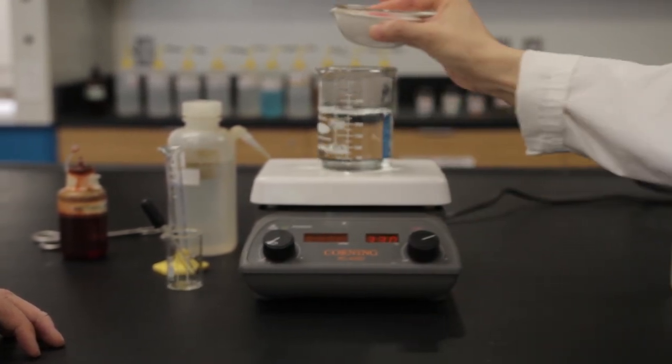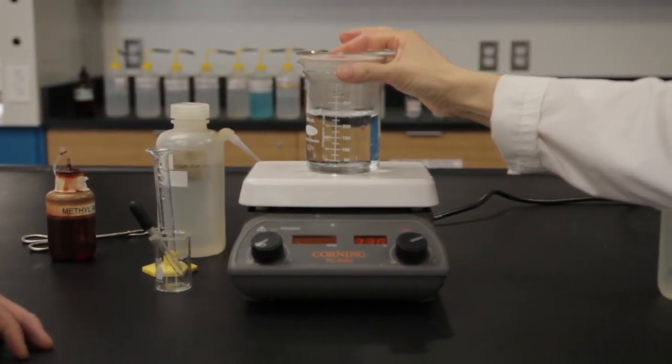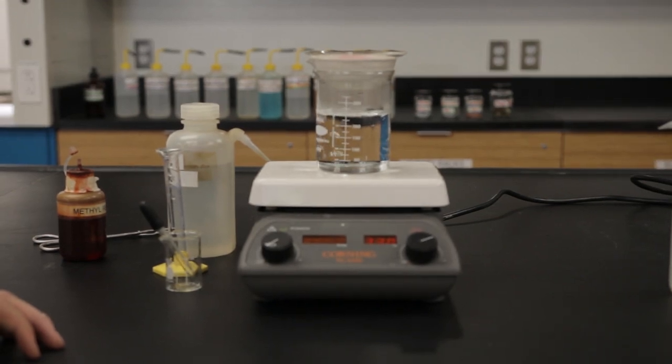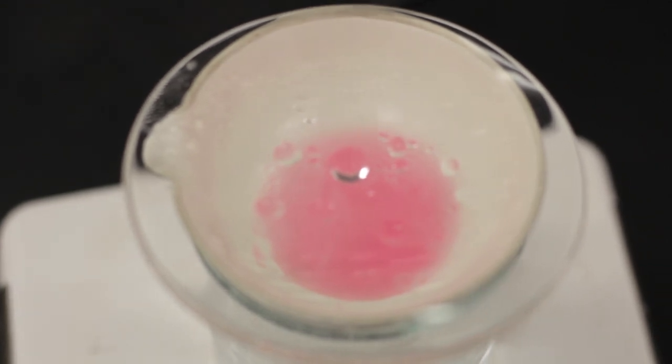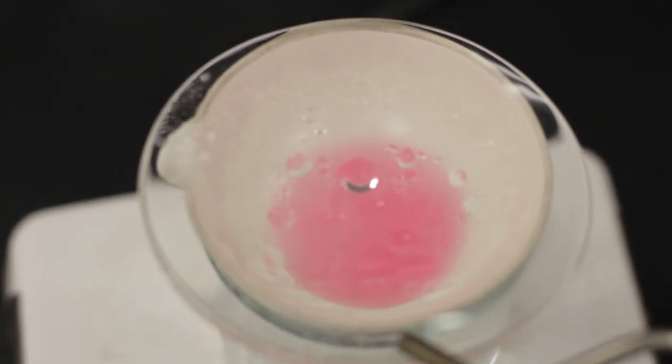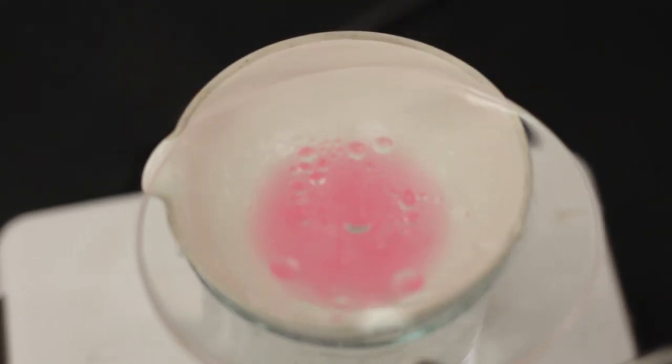Place the evaporating dish on the hot bath to heat the solution. Heat for approximately five minutes after the solution has warmed up. As the solution is heated, if the solution turns yellow, add more hydrochloric acid until the pink color returns.